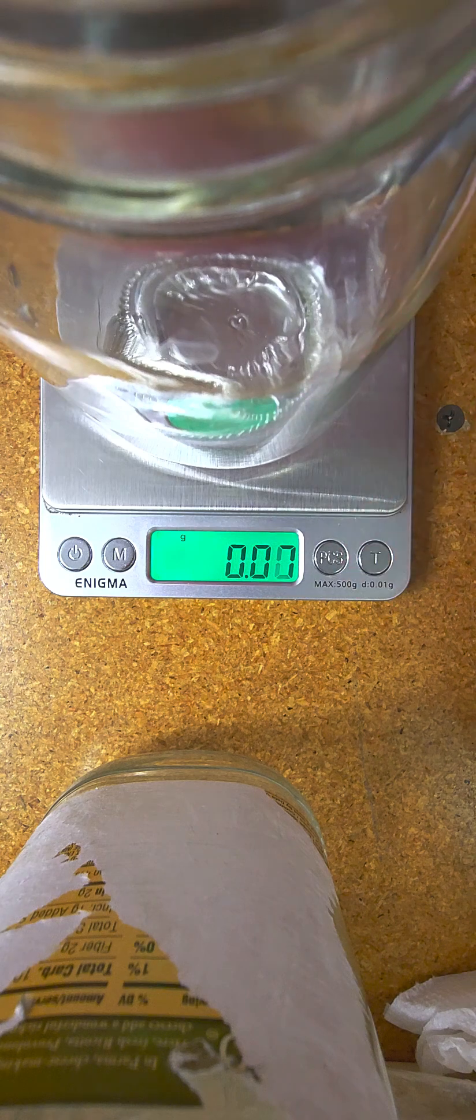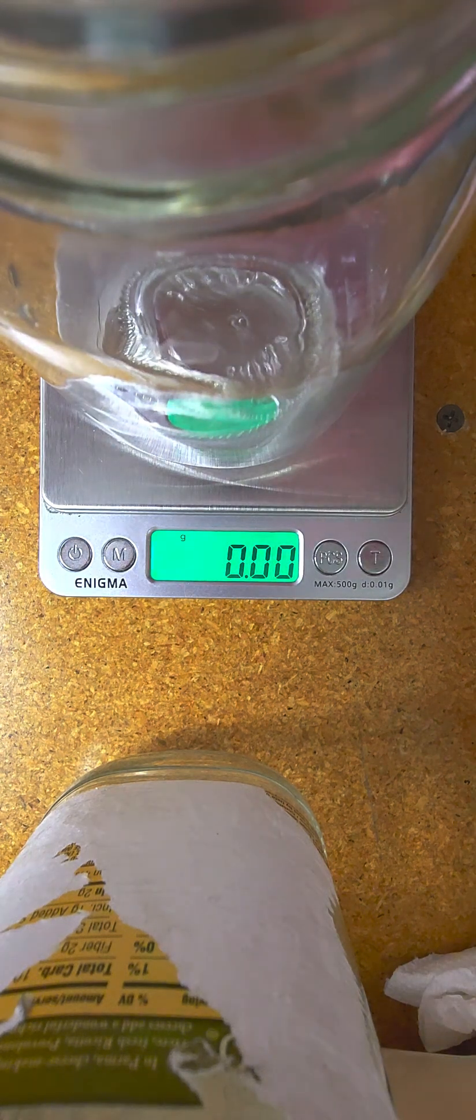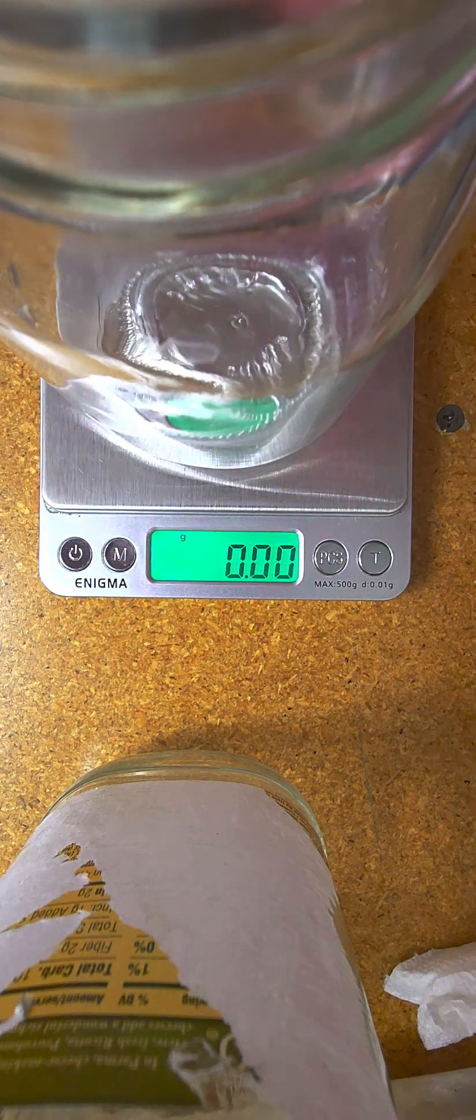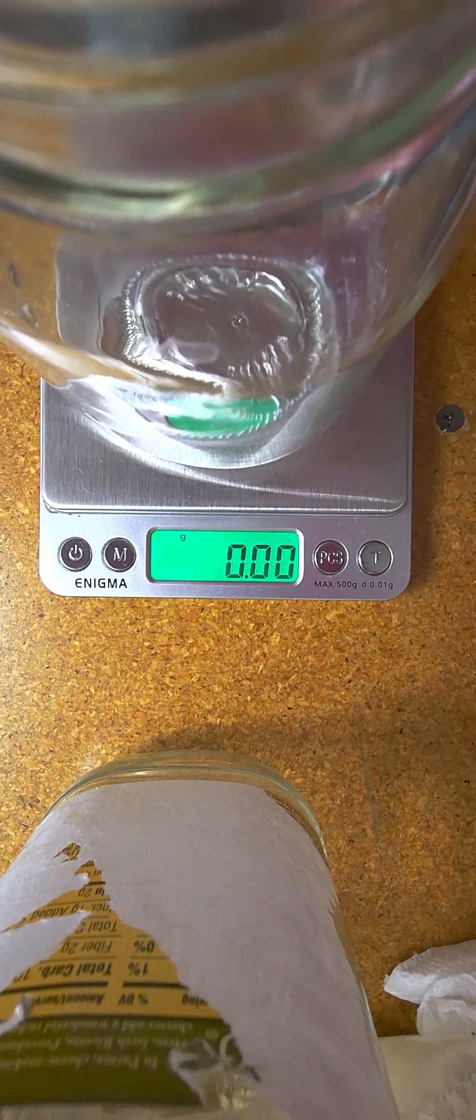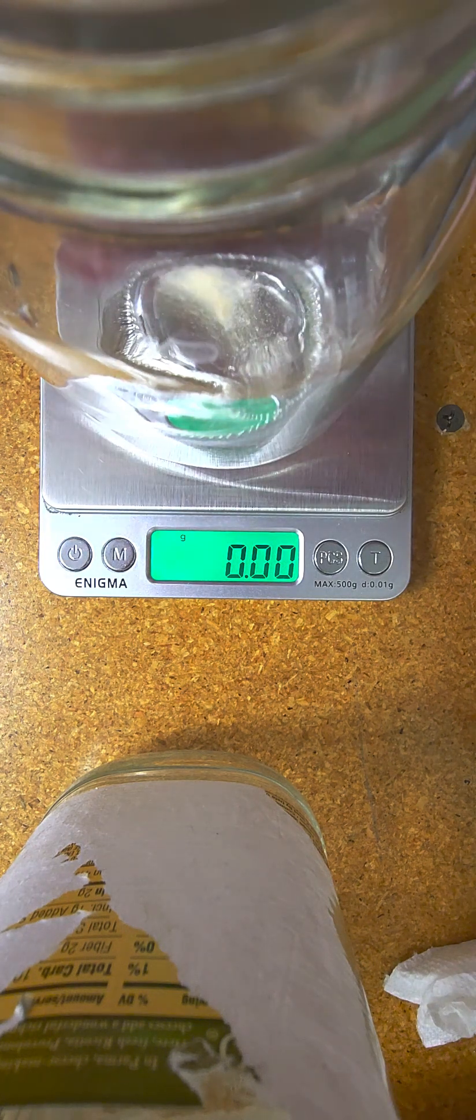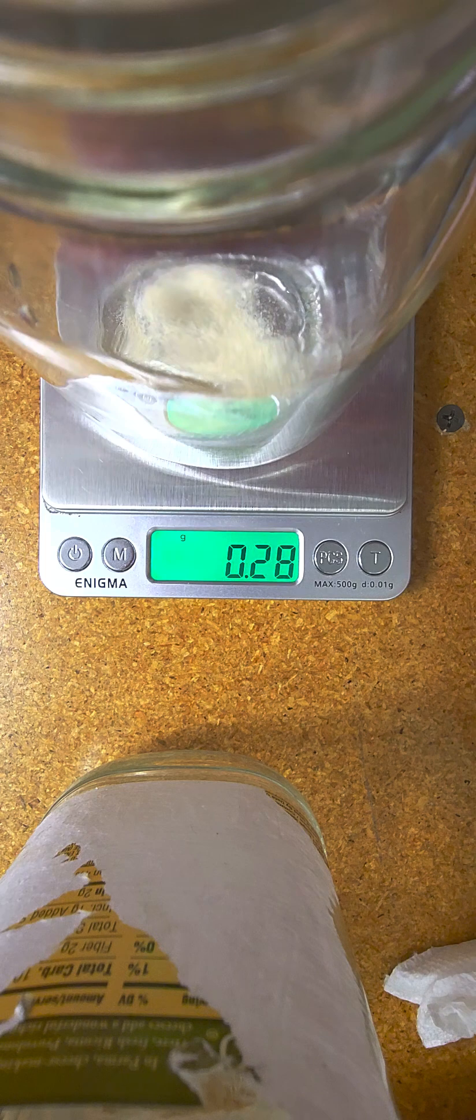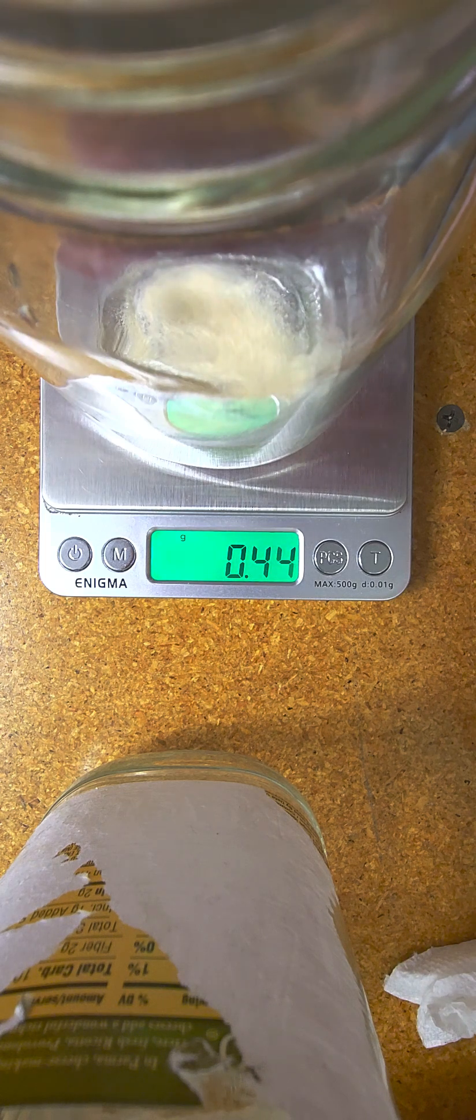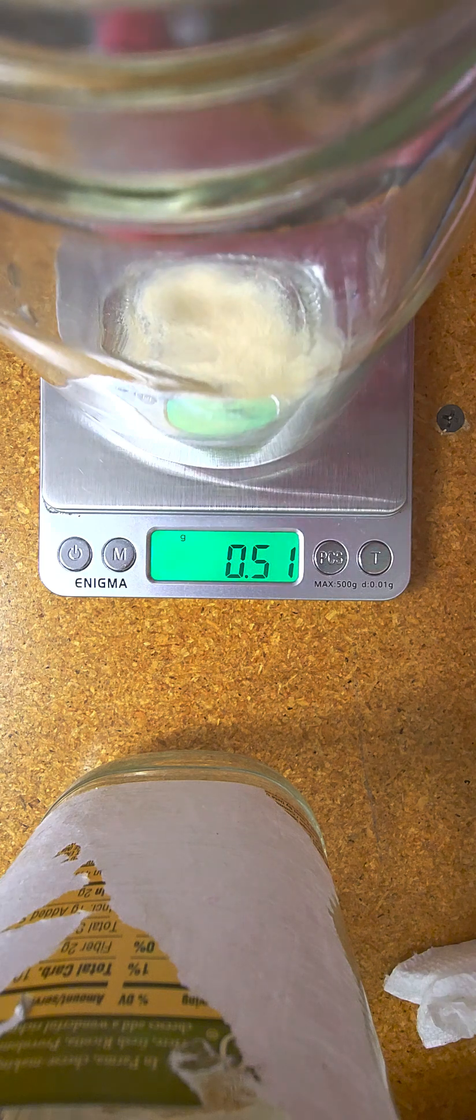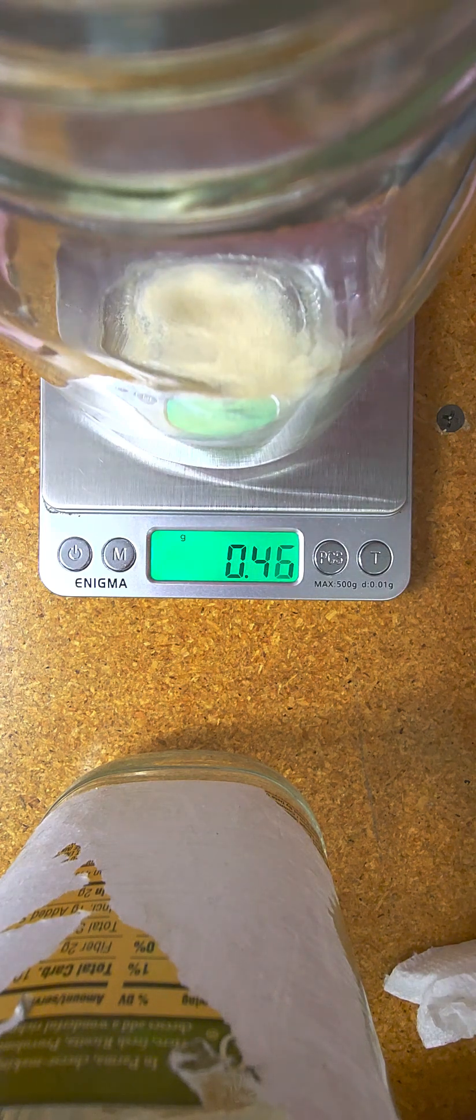We'll tare that and we are going to add a half gram of light malt extract. Just a half gram of light malt extract. There's our half gram. We are one hundredth over, that is alright.